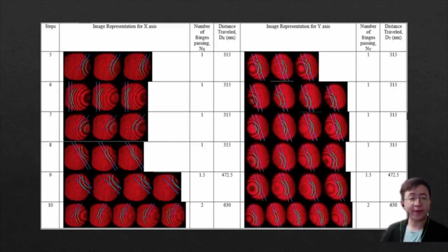Anything before 5 steps, we observe that there is not much movement to no movement at all. But for anything beyond 10 steps, we can see that the blurring effect starts to happen. As you can see around here, blurring effect starts to happen, rendering the result capturing sometimes impossible.